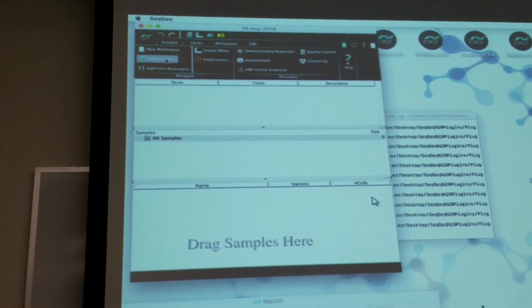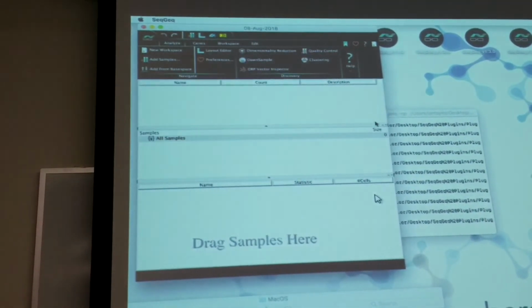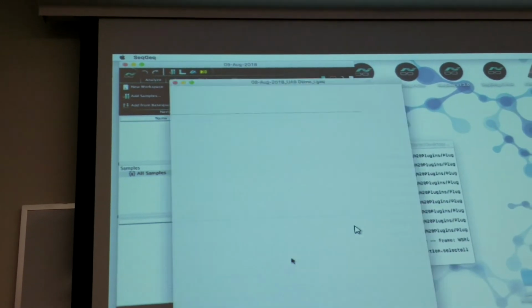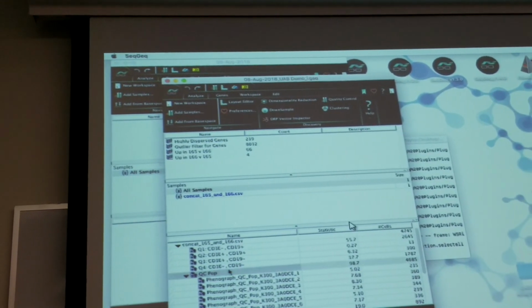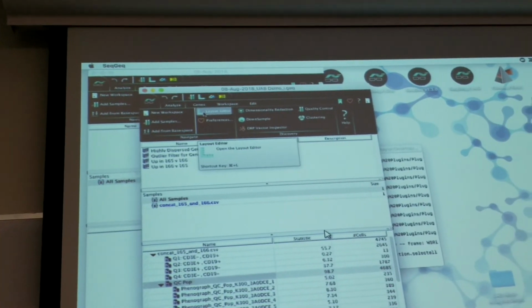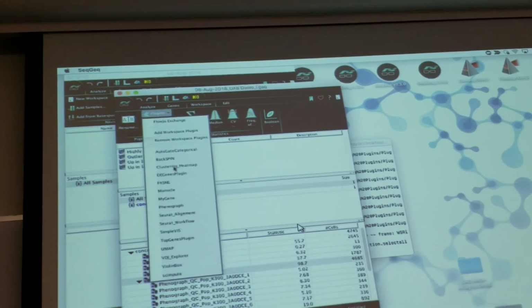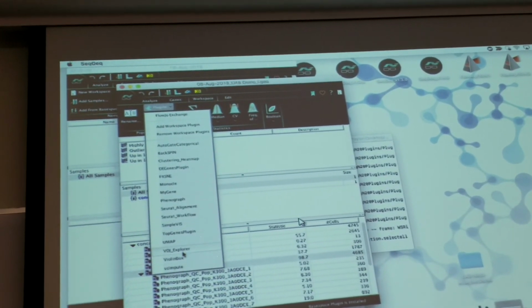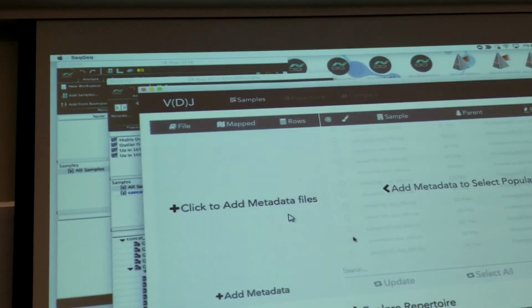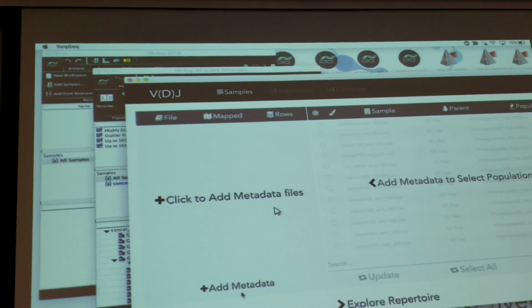Right. I was expecting that for one particular heavy and light chain pairing and the different V, D, J gene segment usages, there would be more than 1 member in there. Yeah, it seems like in a lot of cases there are very few clonotypes that repeat.